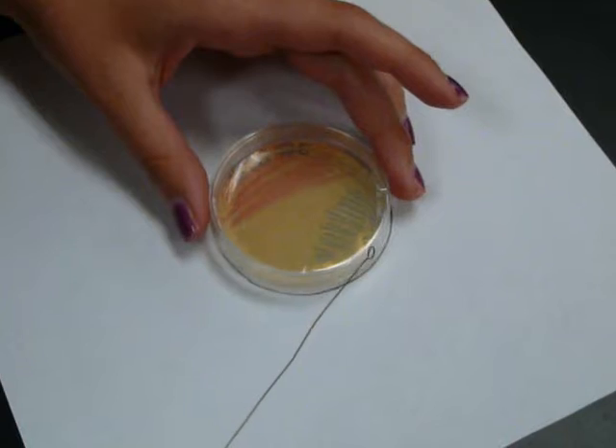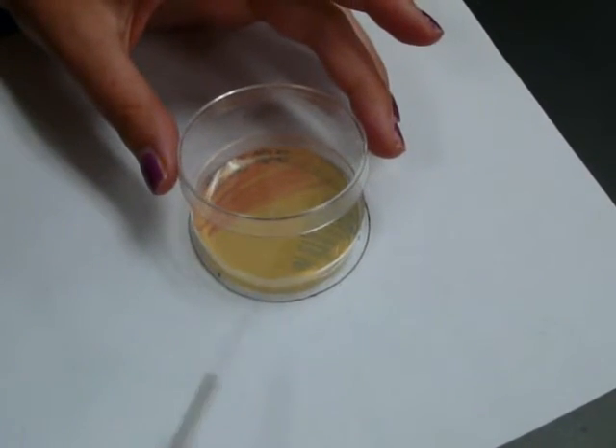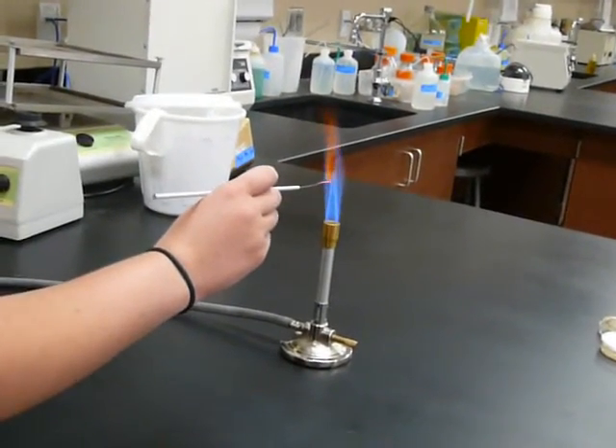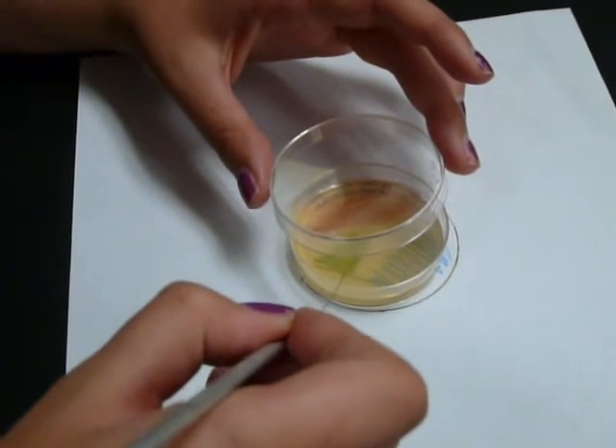Flame the loop. Drag the loop through the previous streak and onto the other side of the plate. Flame the loop again, then go through your second streak and make a third streak on the remaining spot on your plate.